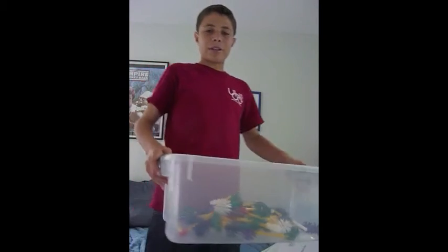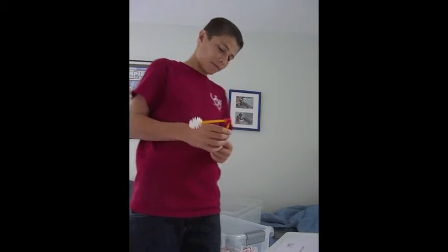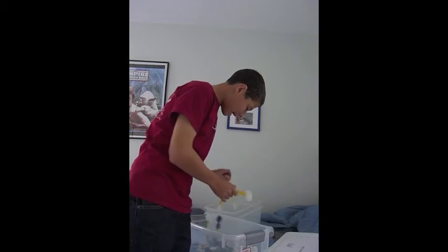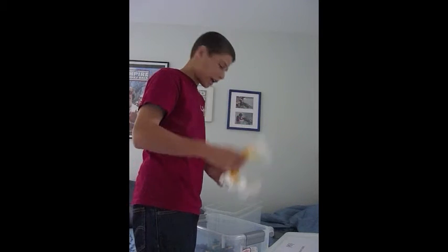So let's take a look and see what was formed. What do we have here? Well, we know that the red is lead. And we know that the white is iodide. So we have lead iodide. Lead iodide. Some more lead iodide. Lots and lots of lead iodide.